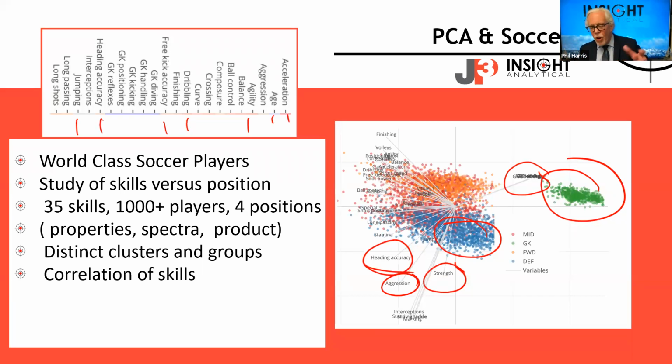So the problem when we have real world data, and you can kind of see it here, there's a lot of scatter. When we have real world data, there's often lots of scatter and variability. When you're doing spectroscopy, there may be baseline shifts, there may be dirt in there, there may be wax in there, there may be additives sometimes, so things can change on us.